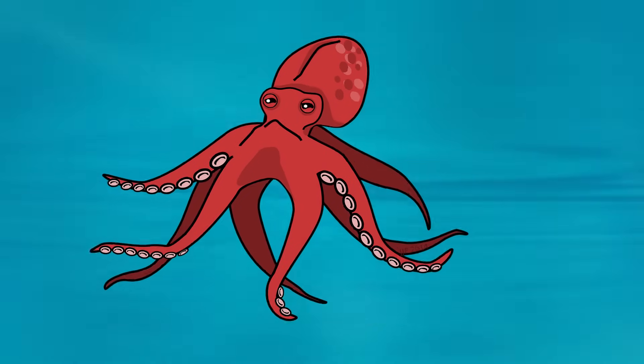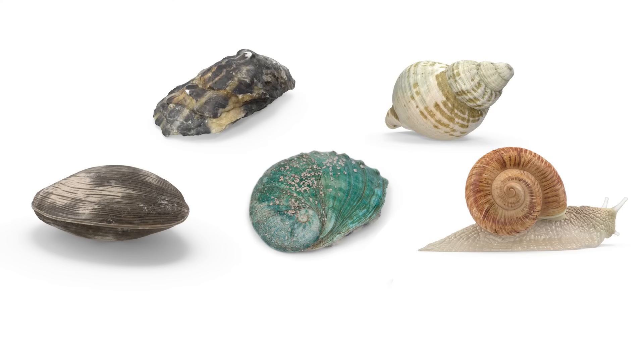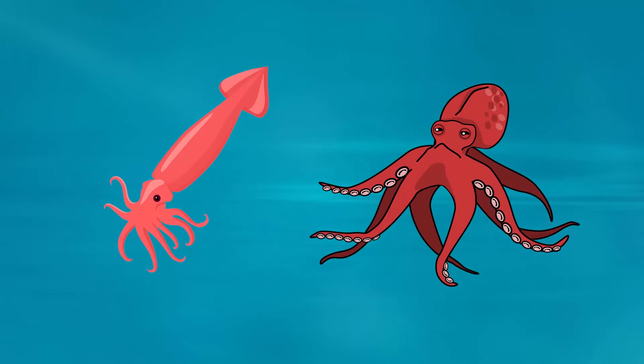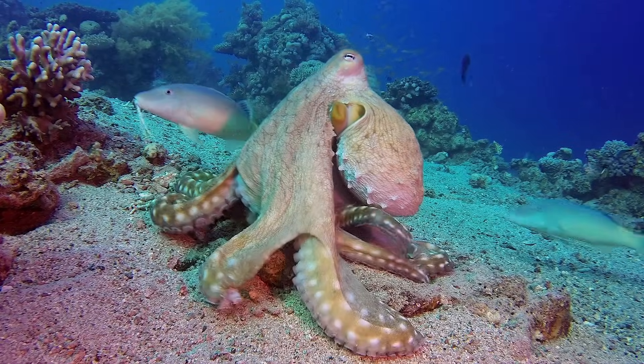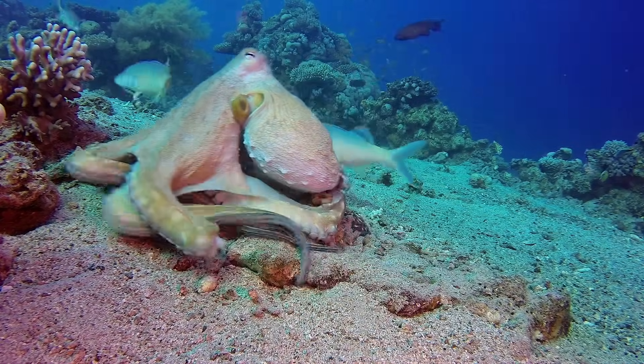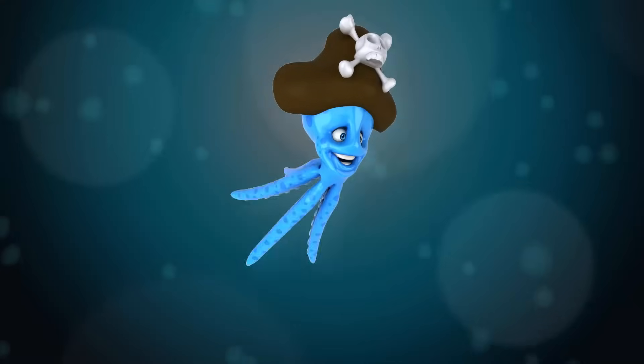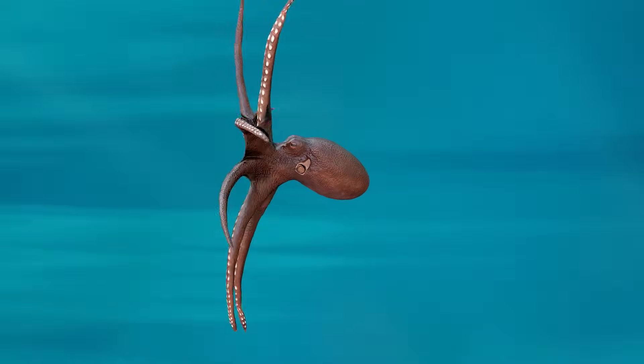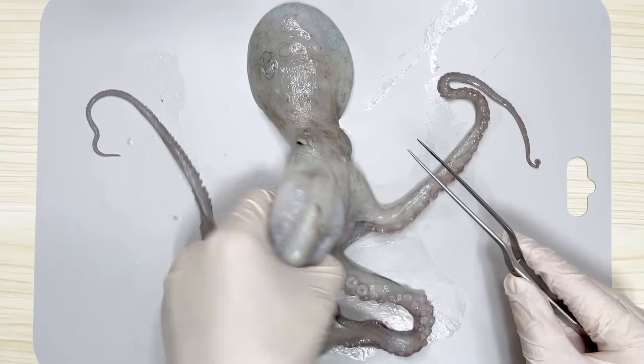Octopuses have a unique characteristic. Most mollusks have a hard shell to protect their soft bodies, but you won't see a shell in an octopus. The ancestors of octopuses did have shells. However, octopuses have lost their heavy shells through degeneration and gained fast movements instead. As a result, octopuses are swift predators in the ocean, hunting for prey.